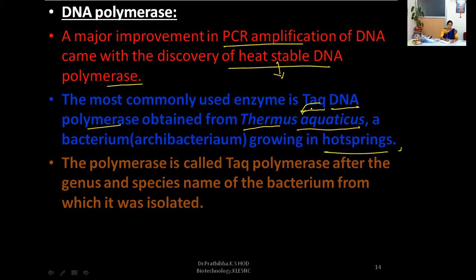This enzyme also exhibits exonuclease activity. It is responsible for synthesis of the DNA molecule according to the template DNA, extending the primer based on the template.